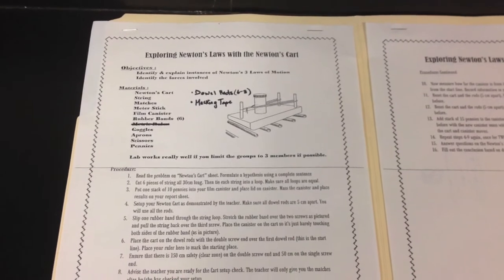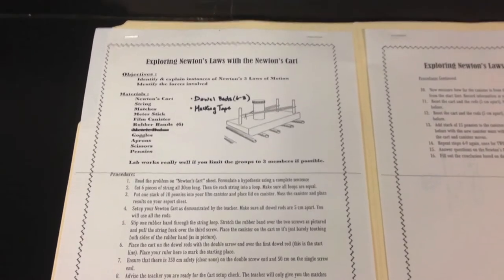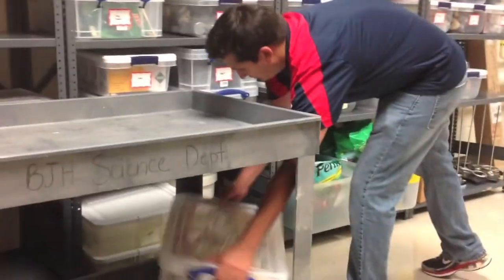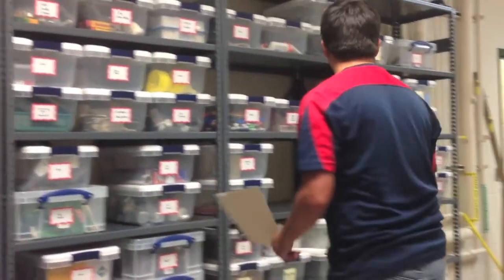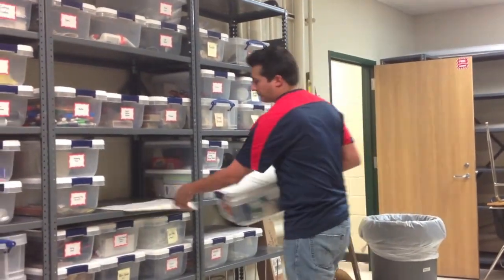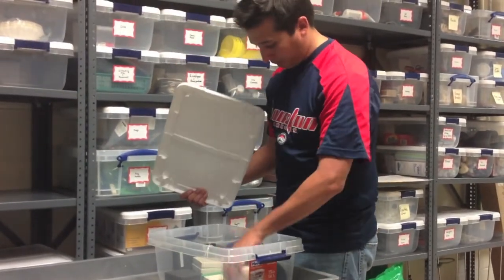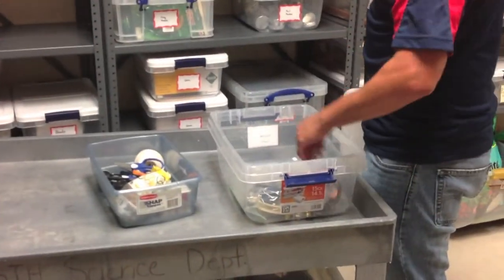Next, we are going to use our newly revamped storage room for a lab that we conducted during the school year. The way that the storage room is organized helps the science teacher prepare for his or her lab with ease, and it allows for a one-stop shop of items listed on your lab. You now don't have the hassle of running back into the storage room for more supplies. Everything is clearly labeled and accounted for. Having the department storage room in this alphabetical system cuts down on lab setup time and allows the teacher to focus more on the lab itself.